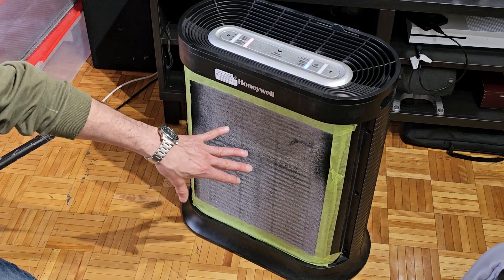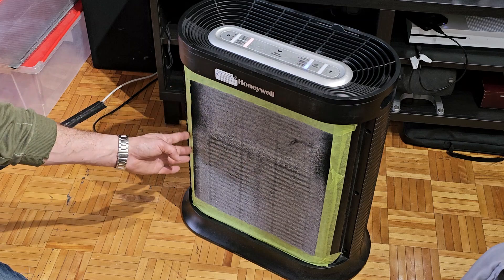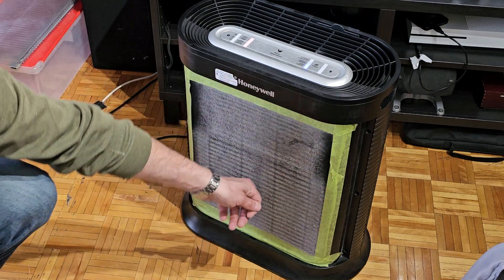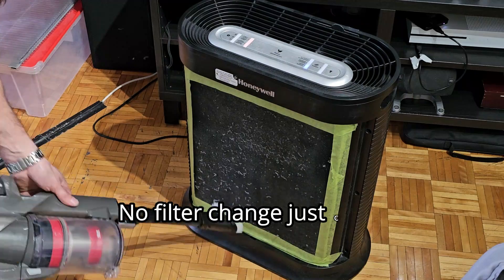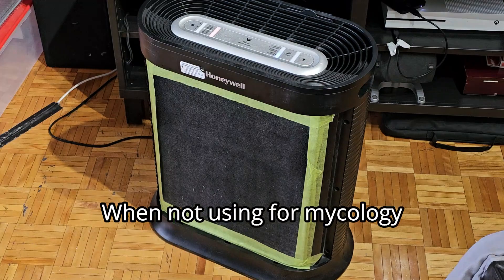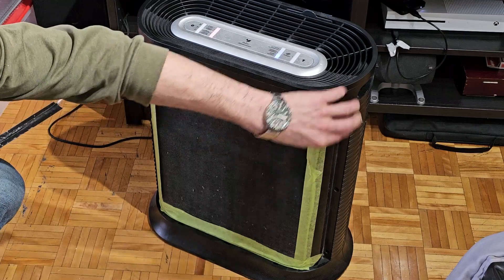To prolong the life of the HEPA filters, I just use some green painters tape around the edges to seal it up, so that everything gets caught in the pre-filter, which I can easily vacuum off. Pull the tape off here so you can see.